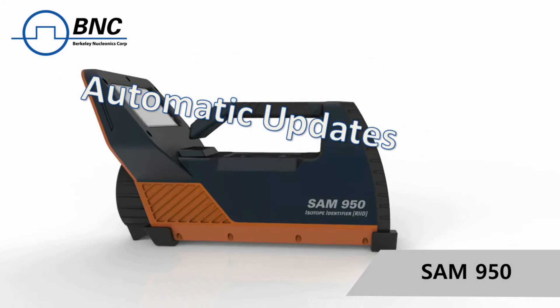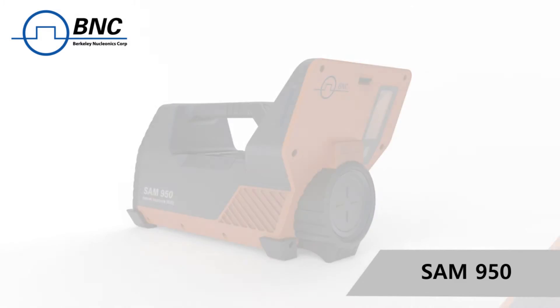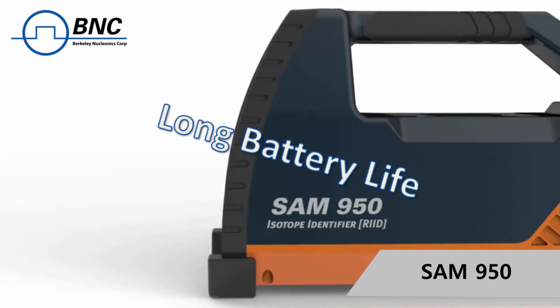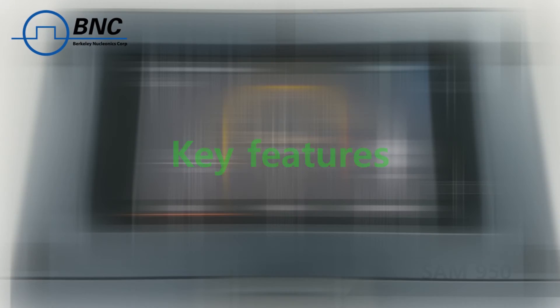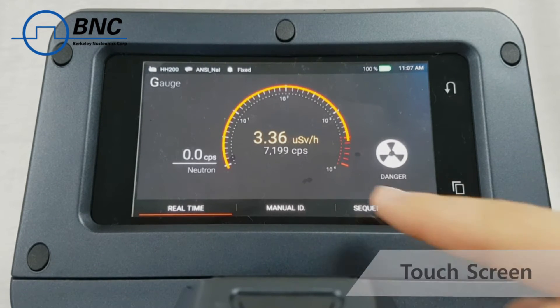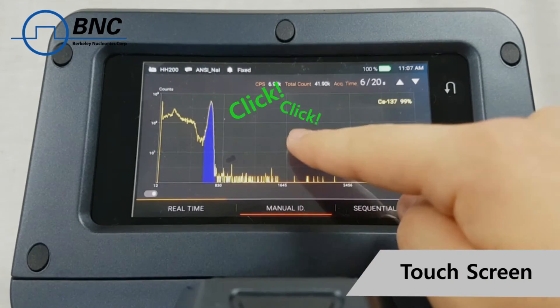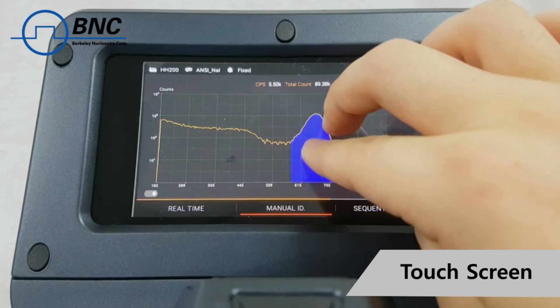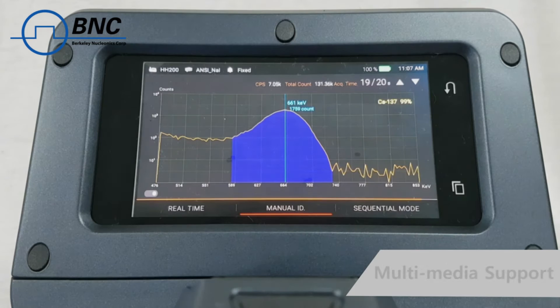The Model SAM 950 is designed to meet ANSI N42-34 requirements for handheld radioisotope identifiers. The touchscreen is an exciting and powerful feature that enables the user to view and analyze spectra, transition through different menu screens, and type in commands using a familiar interface.